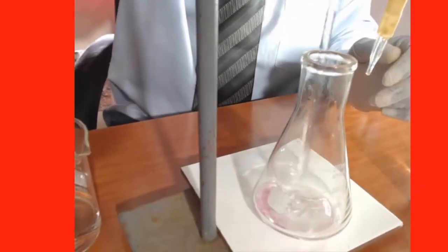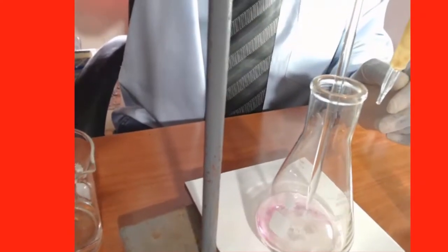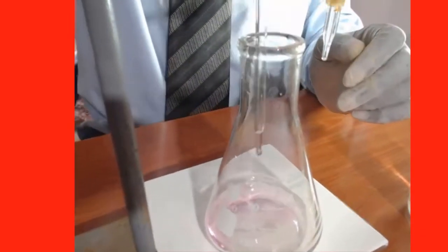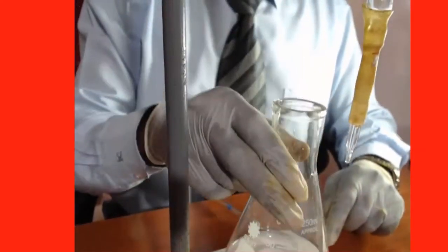Let us now put the solution into the conical flask, and it seems that it had some impurities of the indicator, but there is no problem. We are still going to do our practical. We have 25 cm³ of sodium hydroxide whose concentration is unknown.